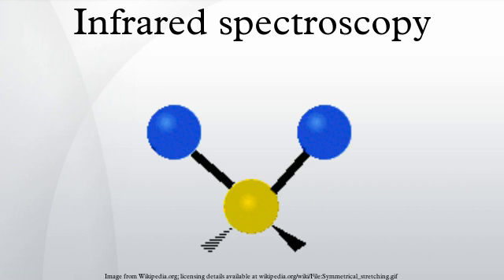With increasing technology in computer filtering and manipulation of the results, samples in solution can now be measured accurately. Some instruments will also automatically tell you what substance is being measured from a store of thousands of reference spectra held in storage. Infrared spectroscopy is also useful in measuring the degree of polymerization in polymer manufacture.